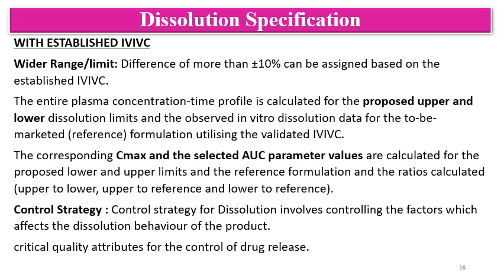And always remember that the dissolution discriminatory power should be proved on the QC release method. That method should not be over discriminatory or under discriminatory. And always we should give the dissolution specification based on the bio batch and the side batches. If there is an established IVIVC, then that established IVIVC will serve as a base for the dissolution specification. So this is regarding the MR formulation dissolution specification and the other information.